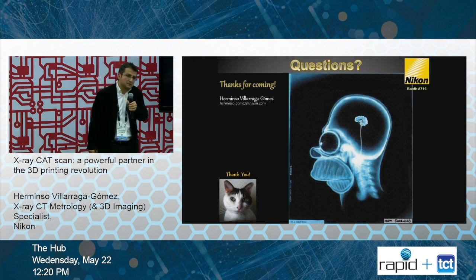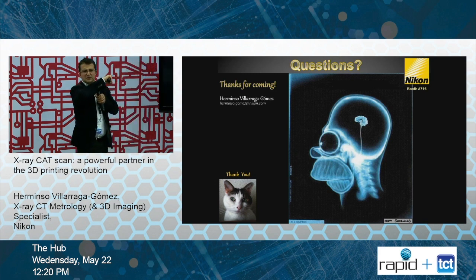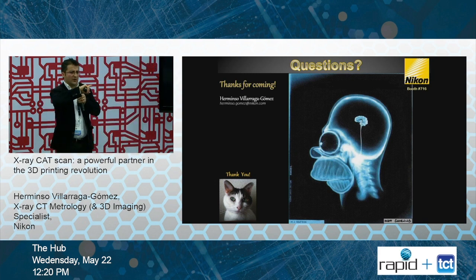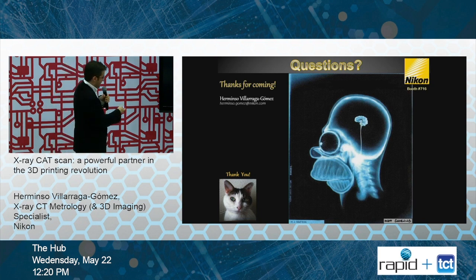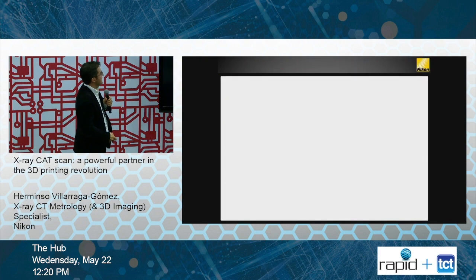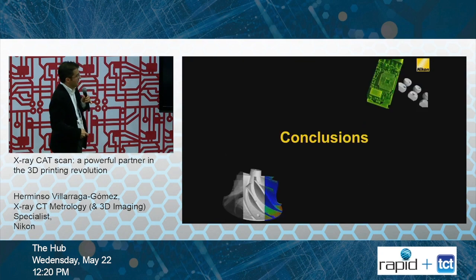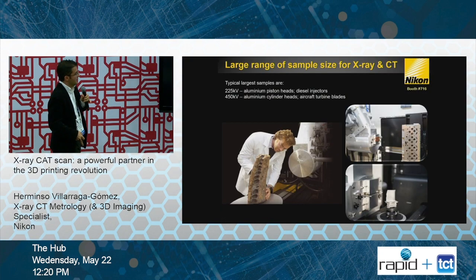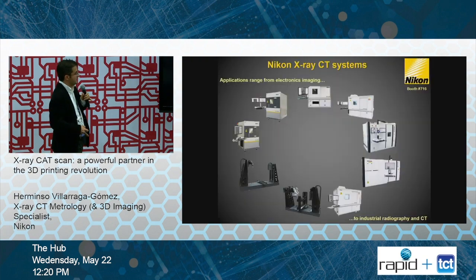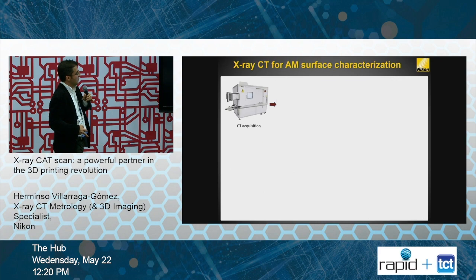Hi, have you guys used this on any 3D printed biomaterials or bioscaffolds? We did. I don't know if you saw the example from Web Medical. Let me go back. But that's one example that people use it for, and also for when they insert stuff in your knees to help the growing of your bones. That also can be done.